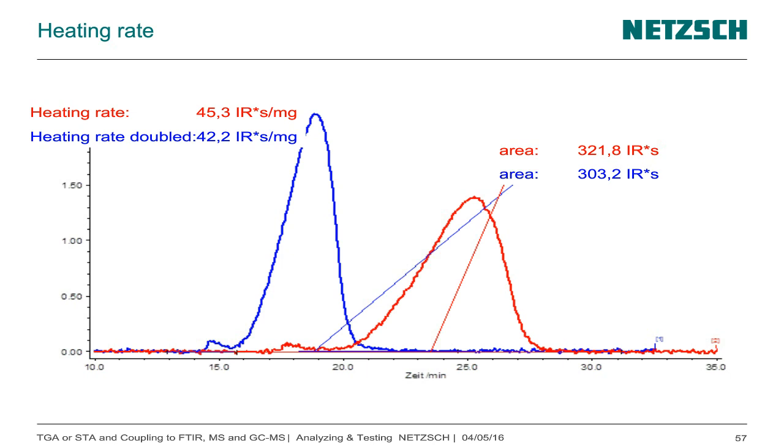And this is sometimes a problem. You have limitations of your detectors, whether you are in the ppm range or below. And with the gas flow, you have a bigger dilution. And then you must think about, can I detect this or not? And you must make your calculations.